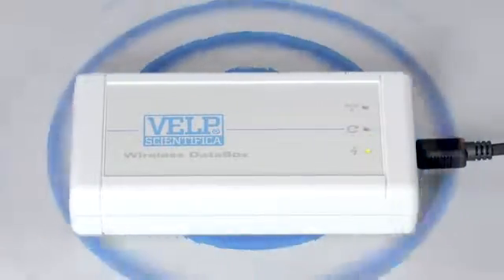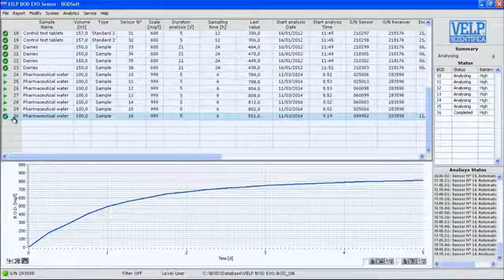Forget about the analysis, results will be sent automatically to the wireless data box.